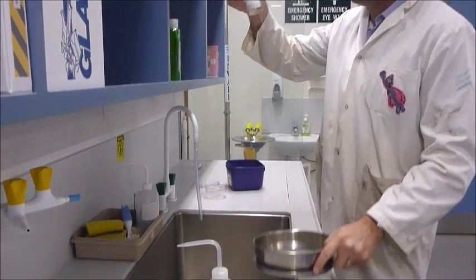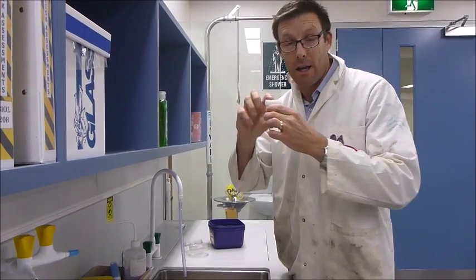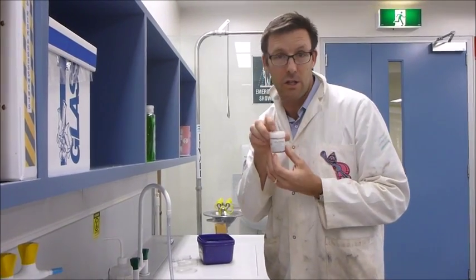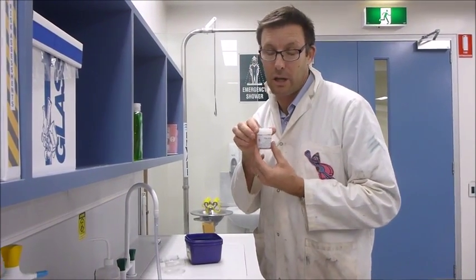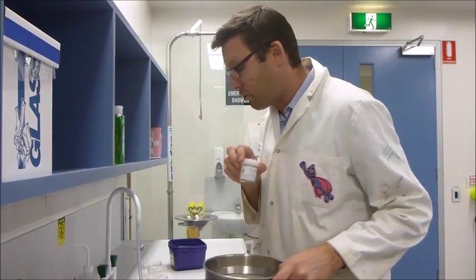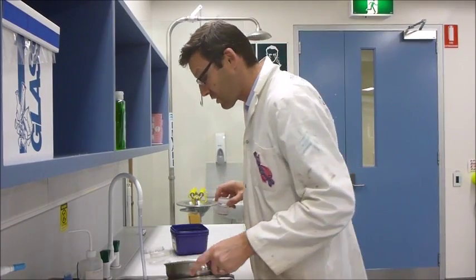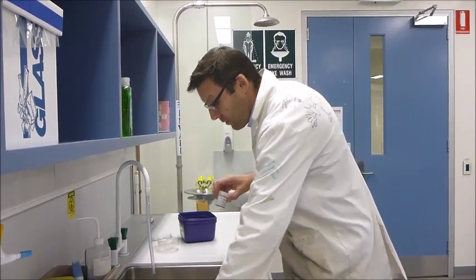What we need to do is to remove our bugs from the ethanol. You'll find that if you are leaning over a dish of ethanol for more than a couple of hours, you will start seeing green men. So it's best to put your bugs into water before you analyse them and look under the microscope. So we're going to do that.